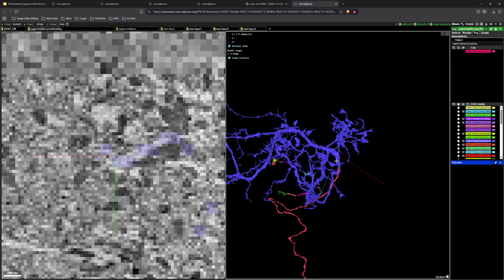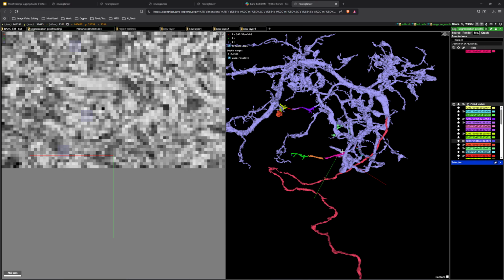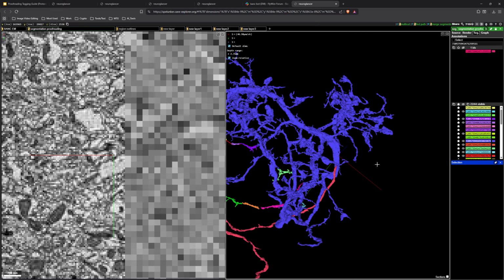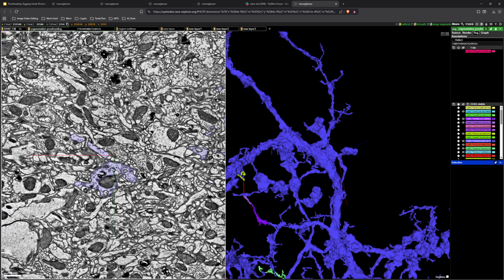Now, when we look at the structure, I was able to find the Soma, but as you can see, I found a bunch of other stuff too, because I was also thinking maybe this is much larger. But after giving up trying to find this large mysterious region that I expected to find, I found the Soma path instead.